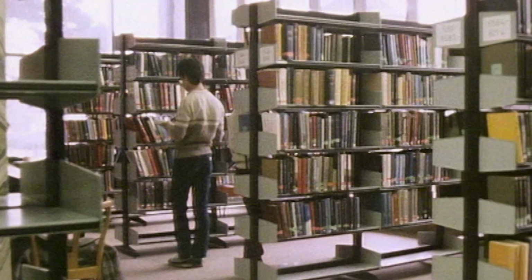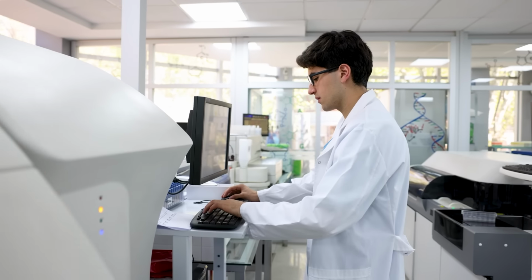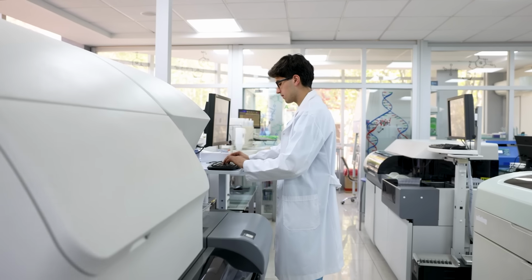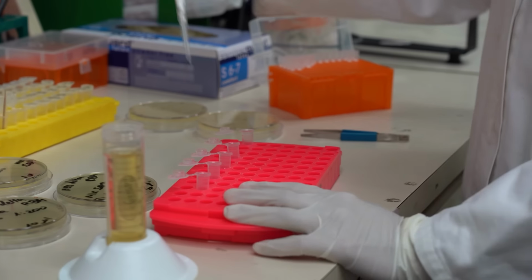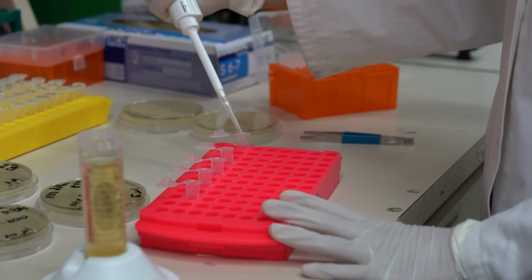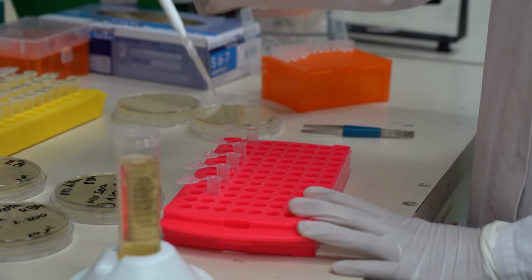One of the greatest boons to modern biology is the overwhelming amount of information available online, from protocols to reagent info and more. And to be a biologist is to really collect and synthesize as much information as possible to create working protocols. Unlike chemistry, we can't really see any of what we're handling until the very end. It's all just moving small volumes of clear liquid around. The real magic happens by designing and correctly following protocols, and that's like 99% of the actual work.